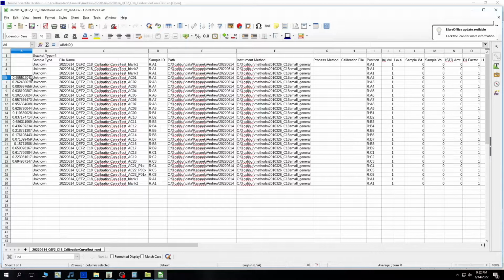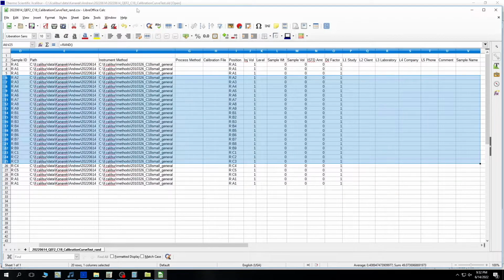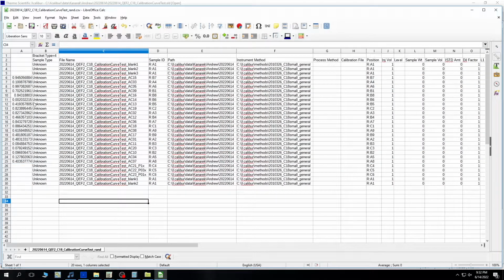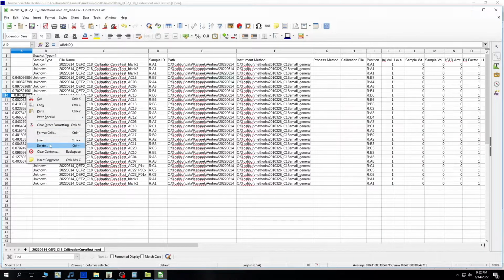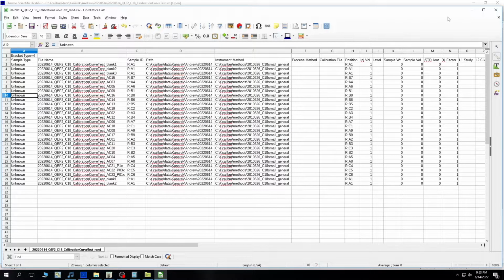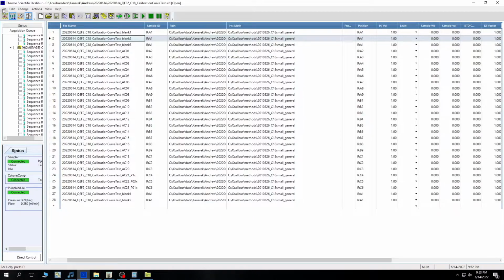And so now we have those randoms. We're going to scan across there, highlight across, and then sort ascending, descending, it does not matter which. Same difference. And now we're going to delete that column, and we're going to save this CSV again.